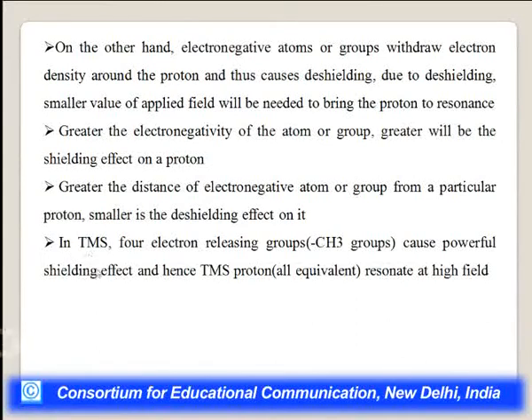Tetramethyl silane is taken as the standard reference for the chemical shift because of shielding and de-shielding. The 4 electron releasing groups cause a wonderful shielding effect, and hence the tetramethyl protons, which are all equivalent, resonate at the highest field strength.